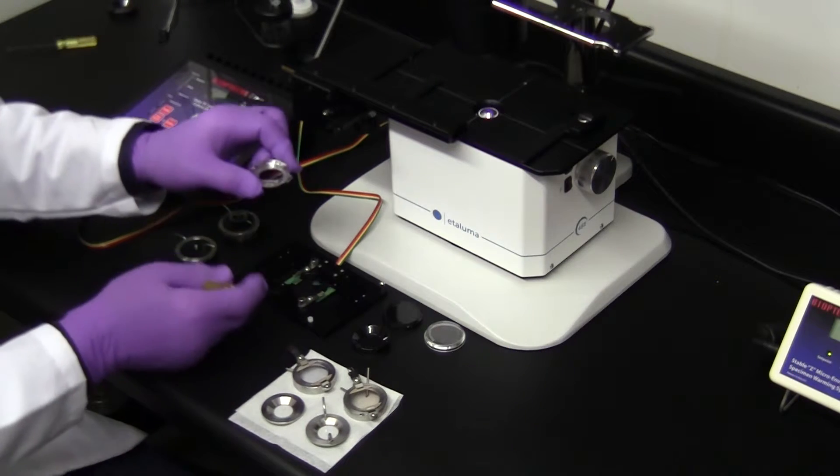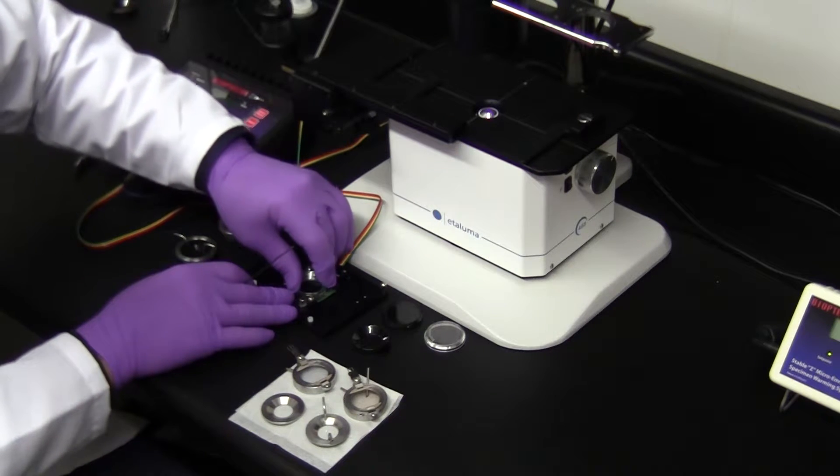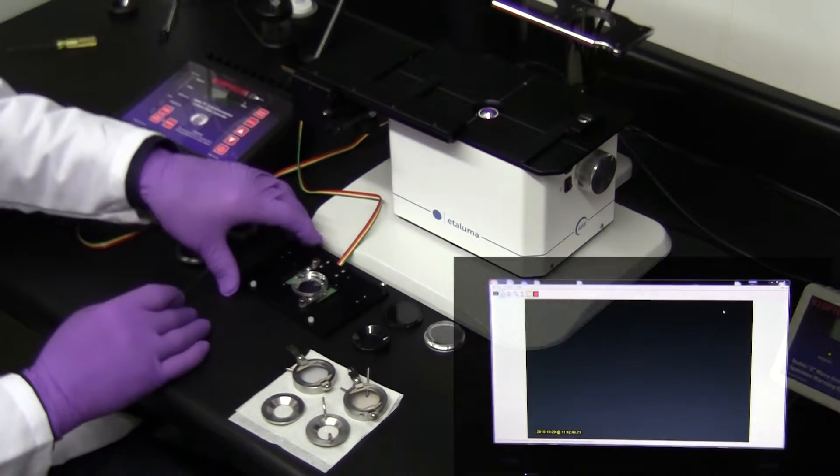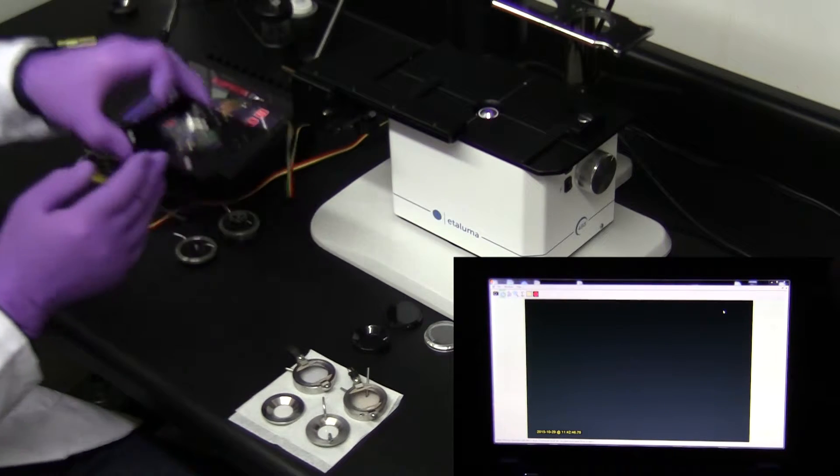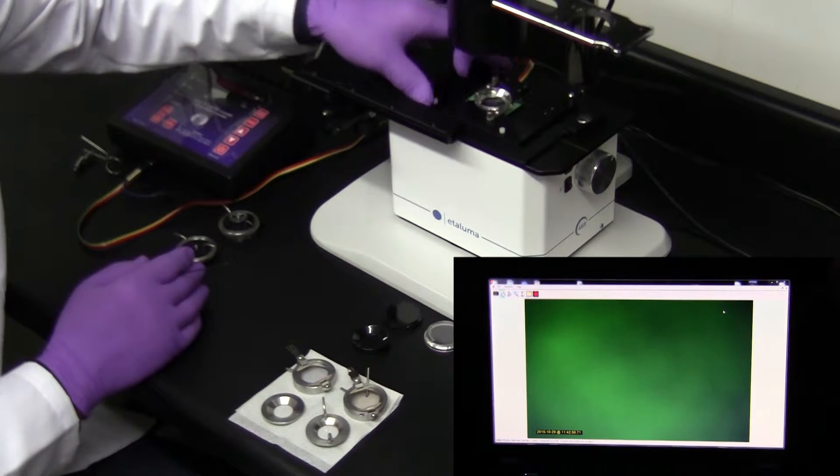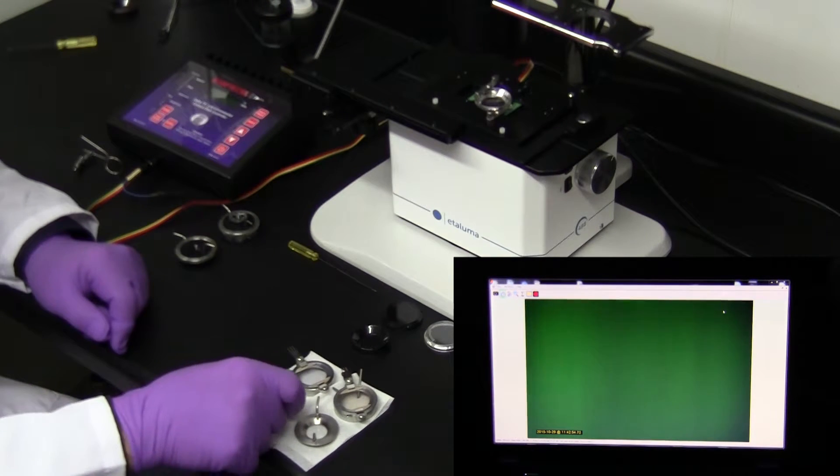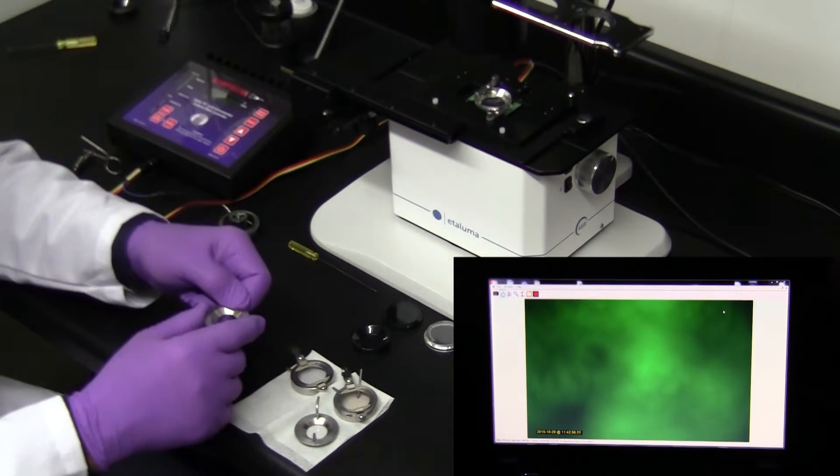An electrical current is passed through the ITO coating and is closed-loop regulated by a proprietary controller. The dish is placed in a SLAS stage adapter having a temperature sensor and electrical contacts to power the dish. There are numerous accessories for the Delta-T to accommodate a wide variety of specimen types and imaging scenarios.